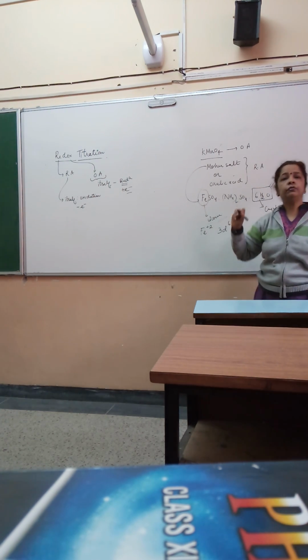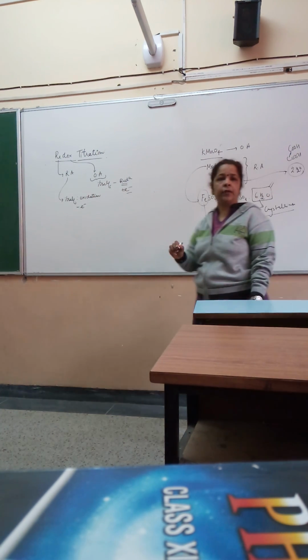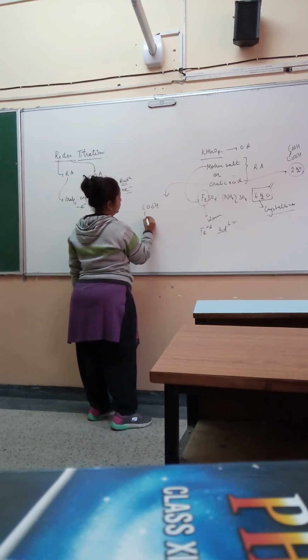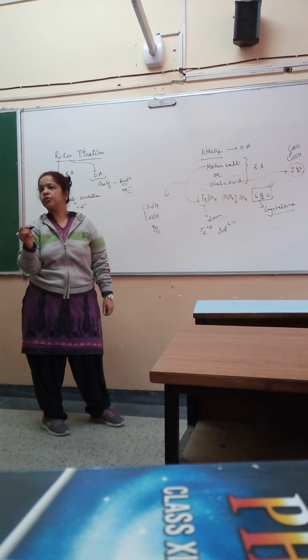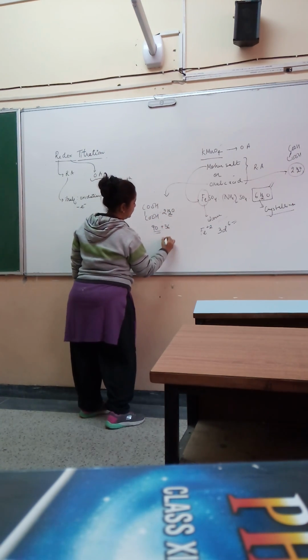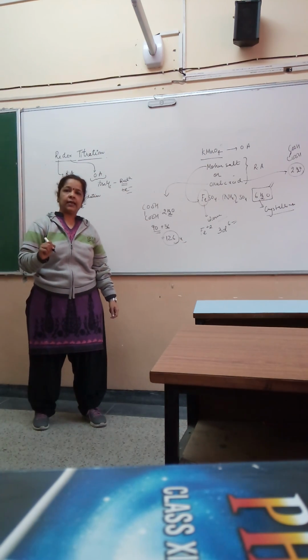What do we call this? Water of crystallization. So, because of the water of crystallization, this is a crystalline salt. So is true for oxalic acid. There is a 2H2O along with COOH, COOH, where the bond should be between the two carbons only. When you talk about oxalic acid, the mass, if you calculate with a COOH and a COOH, comes out to be 90, which would be wrong. For any calculations or solutions, you need to take into account 2H2O, which is another 36, makes it 126 u as the molecular mass of oxalic acid.